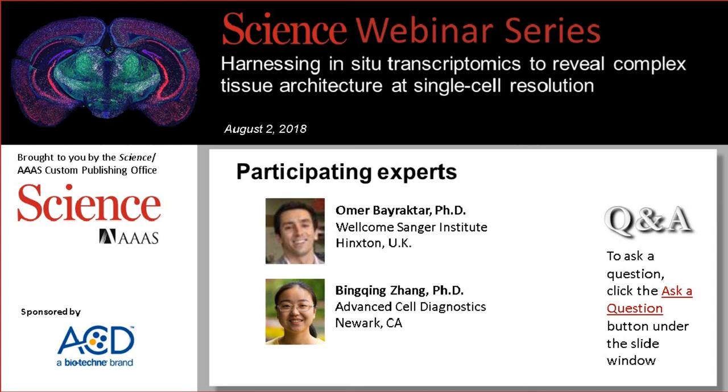So we're almost at the end of today's webinar, but I'd like to get in a couple more questions. Dr. Bayraktar, in view of the extensive dendritic network of single neurons, this viewer asks, to what extent does examining RNA in the cell body represent RNA expression in the entire cell, including the dendrites?